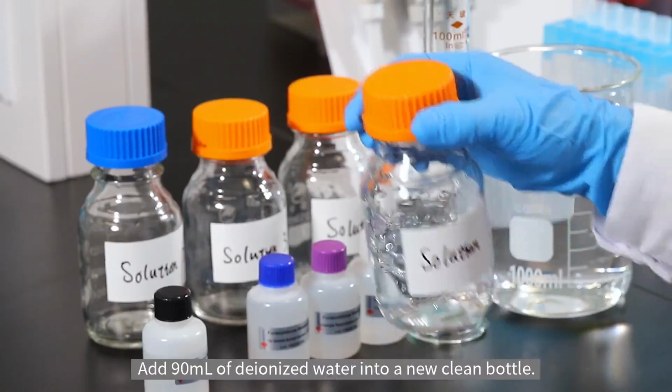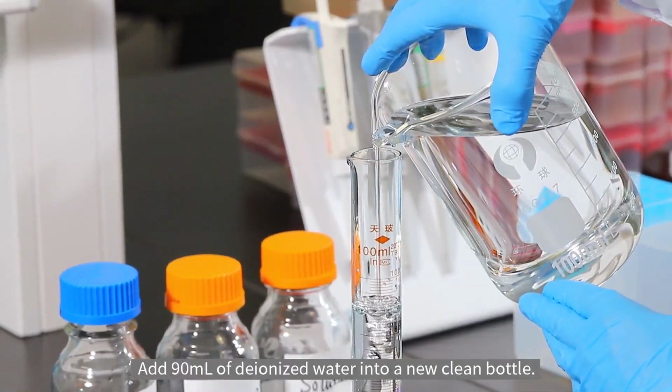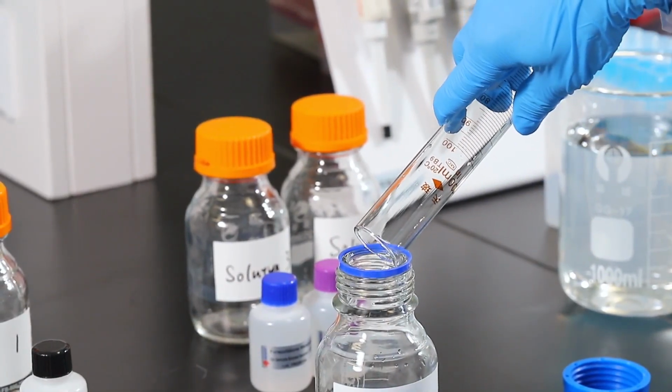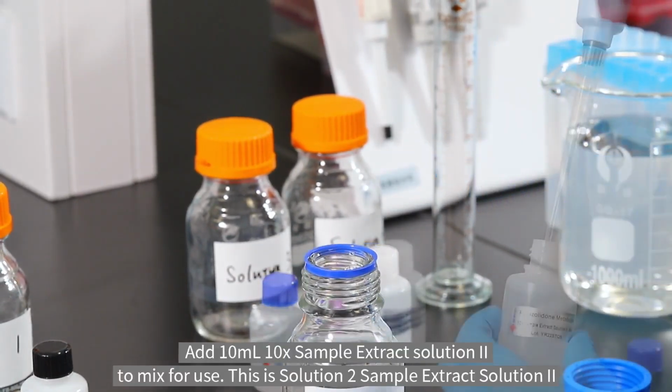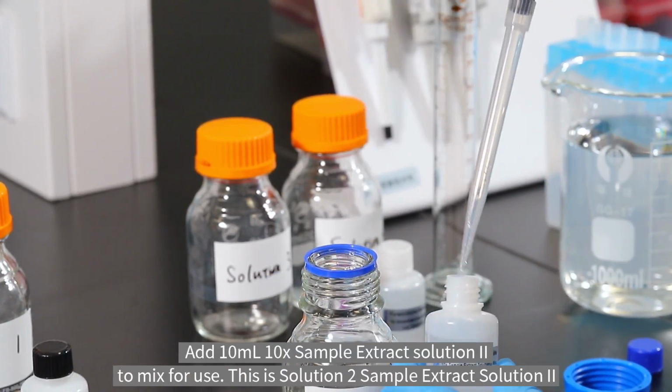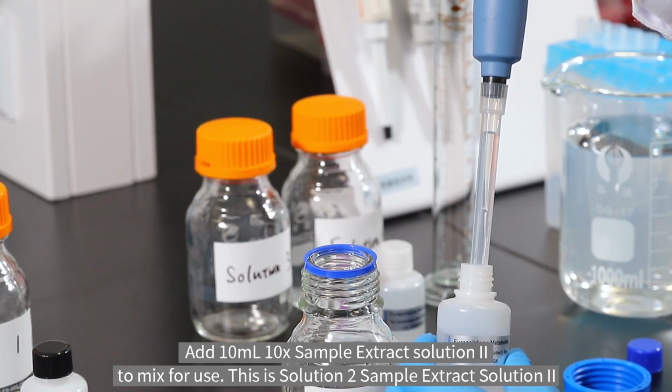Add 90 ml of deionized water into a new clean bottle. Add 10 ml 10 times sample extract solution 2 to mix for use. This is solution 2, sample extract solution 2.